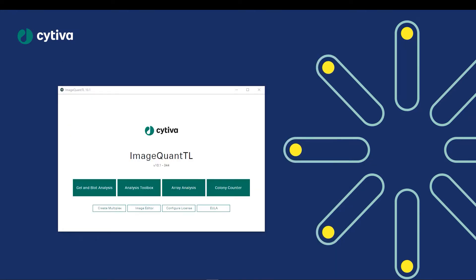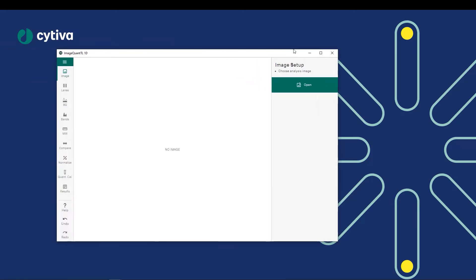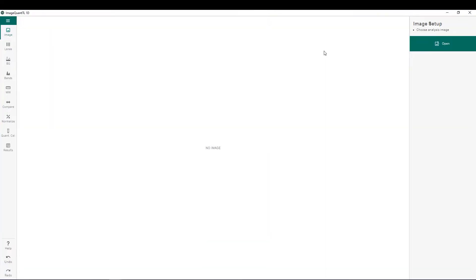Now that we have generated our multiplex image, we can begin the analysis using the gel and blot analysis module. Once open, we can choose to open our image of interest using the Open button on the right side, and then select the DS file which was just generated.